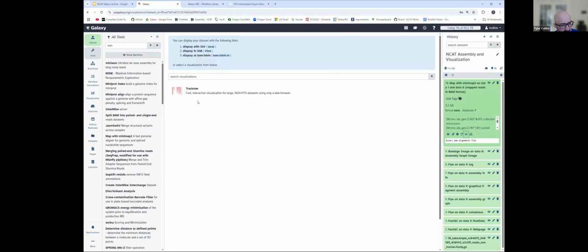I'll say right now, in May on the next Galaxy release, there's a big overhaul of the internal visualizations that drastically improve them and allow way more complex ones. Right now, most of them work fine, okay, but I think in about, I don't know, 4 to 5 weeks, you should see a lot of brand new ones that are significantly more complex, especially on the spatial omics side. But for our case, we're going to be working with this and showing how it works with IGV.